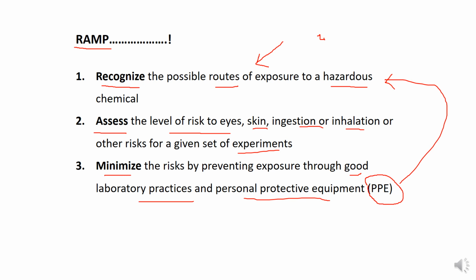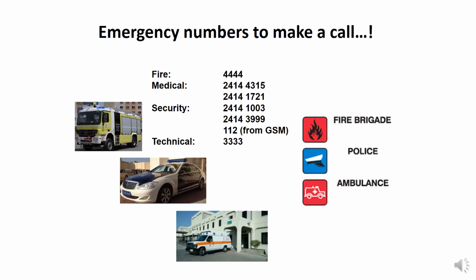Similarly, if chemicals can enter through your eyes, then you wear eyeglasses. So it is really important to use the right PPE while working with different chemicals.